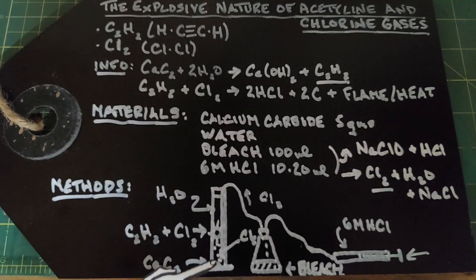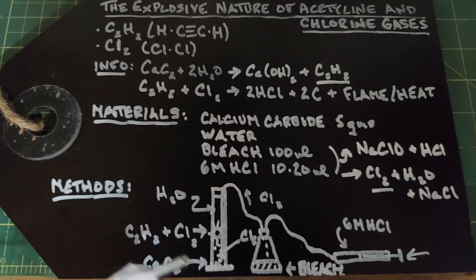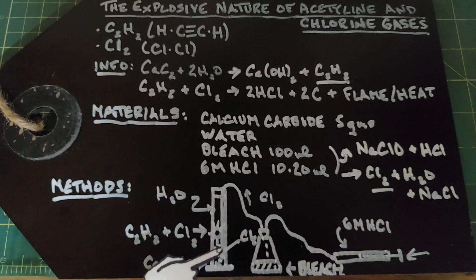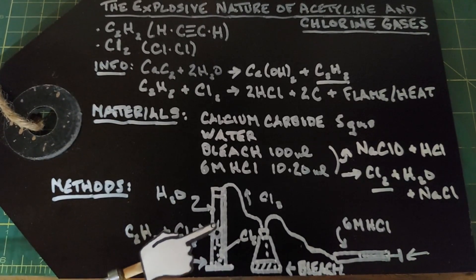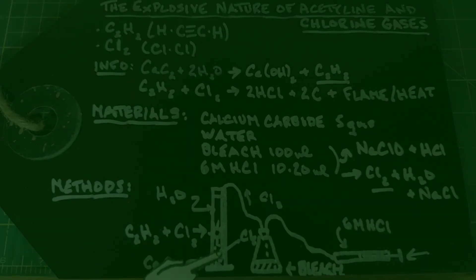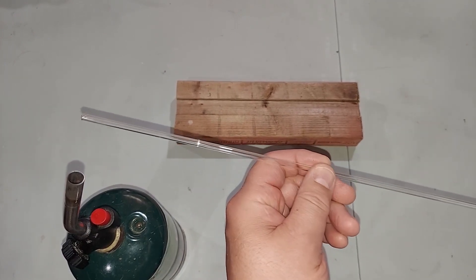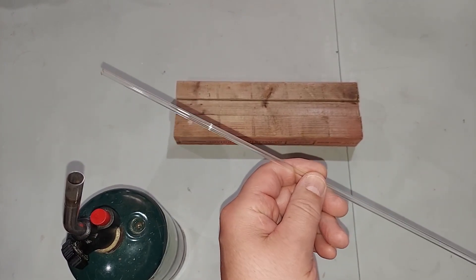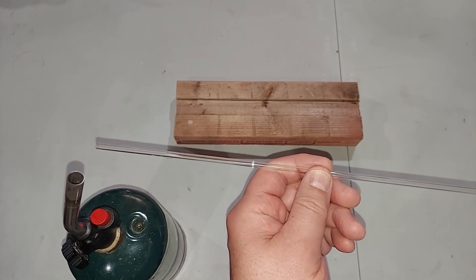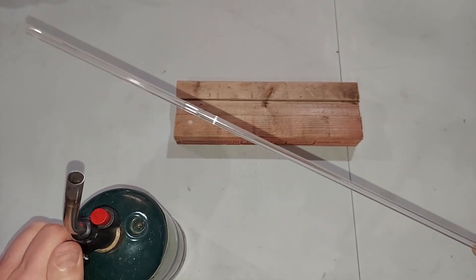The calcium carbide will be producing acetylene gas. When the acetylene gas is bubbling up and the chlorine is coming out and bubbling up, they'll meet from time to time and you'll get this pretty cool looking explosion. That will continue to happen — usually the calcium carbide runs out first. I have a glass tube that's going to go at the bottom of the cylinder, bent at the bottom to get the bubbles of chlorine gas to meet the acetylene gas in the middle.